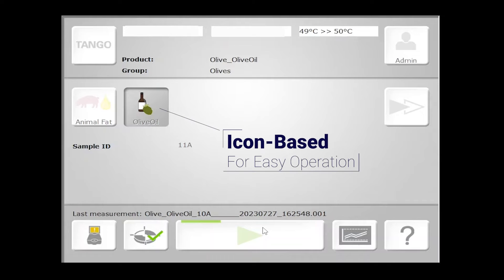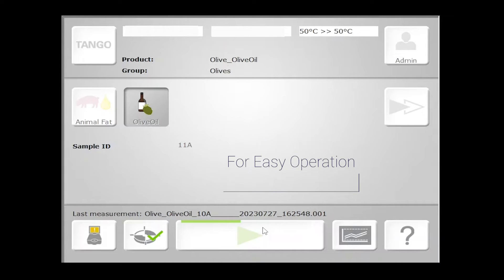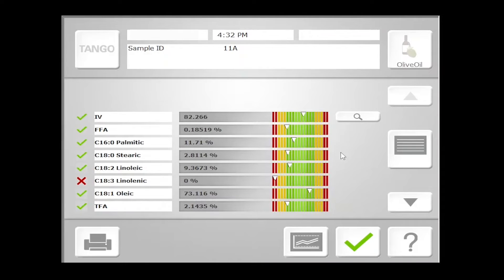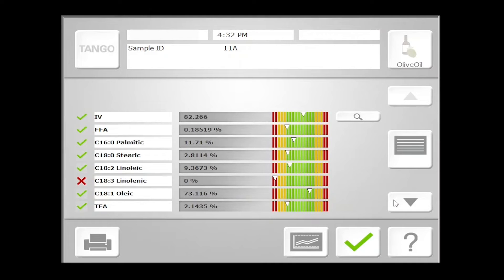Our Tango T will then bring the sample compartment up to the predefined temperature and begin sample measurement. Here, we have both numerical values as well as visual indicators of where our results lie. These visual indicators signal to your operators what qualifies as a good sample versus a sample that may need to be sent off for wet chemistry.